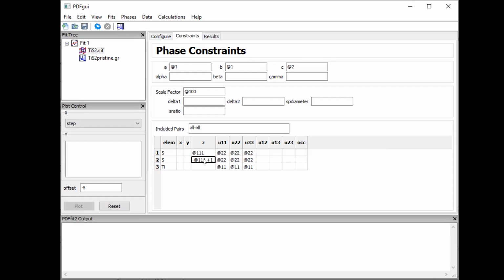Then there's a unit cell translation along one of the unit lengths, so that's why there's a +1. So this site and this site are related by symmetry. We only need to define the position of this one, then automatically the position of the other is defined by the symmetry. And this is more useful when you have a more complicated atoms list.